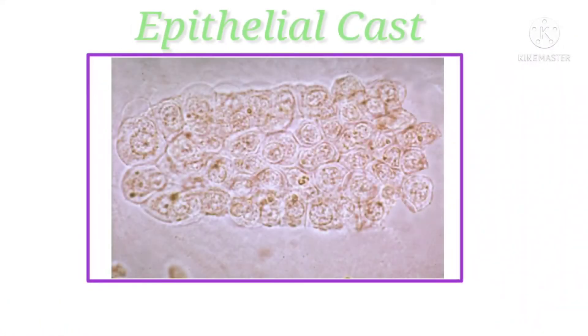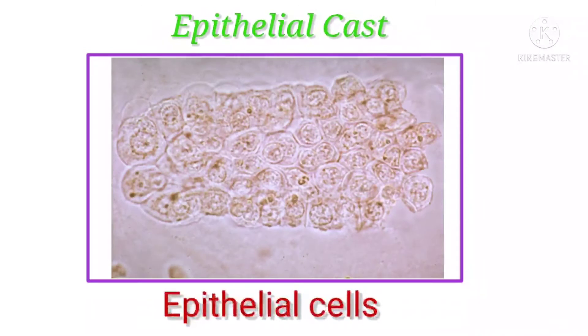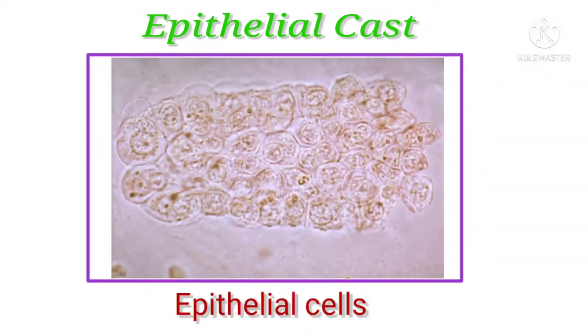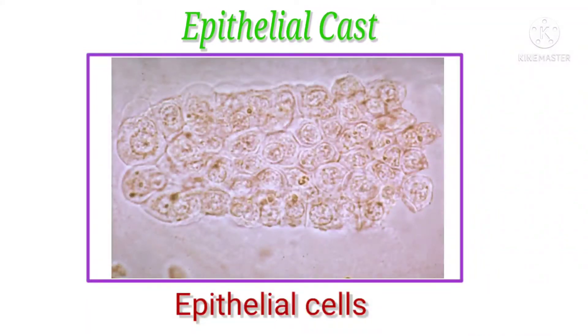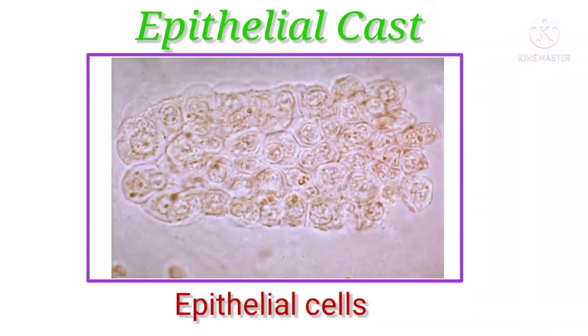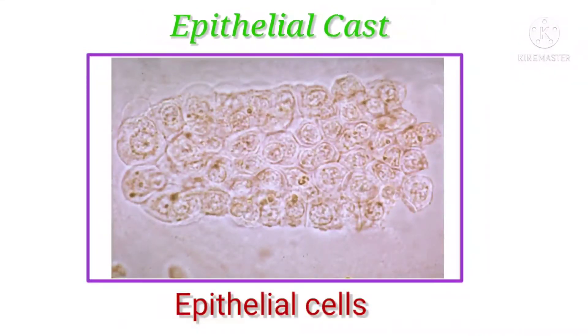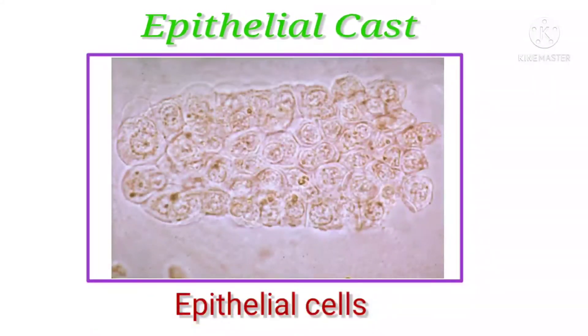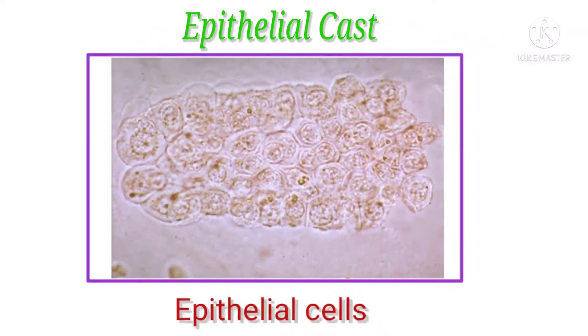More significant than observation of other types of epithelial cells, the cells can be round, oval, columnar, or cuboidal.